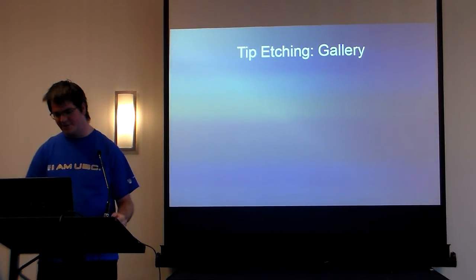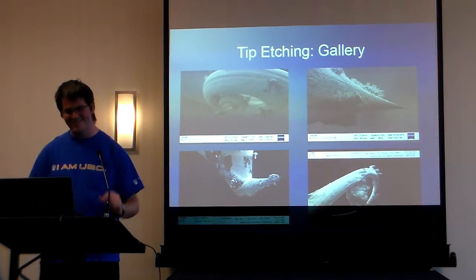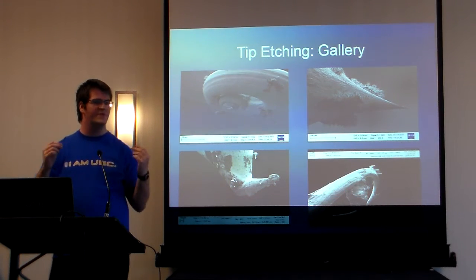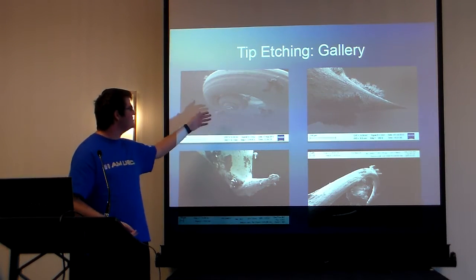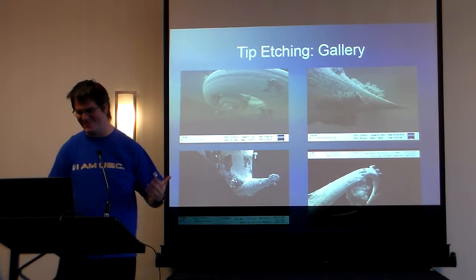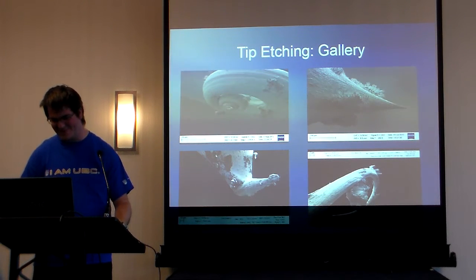And so I'm just going to show you guys some quick pictures of what I did. So first off, that's what can go wrong. These tips are very, very difficult to use, to be careful with. If they touch anything, this happens. Sometimes you get these beautiful spiral patterns. Sometimes you get hair. I don't really know what happened there, but these are some of the not so good tips, but still interesting to look at.